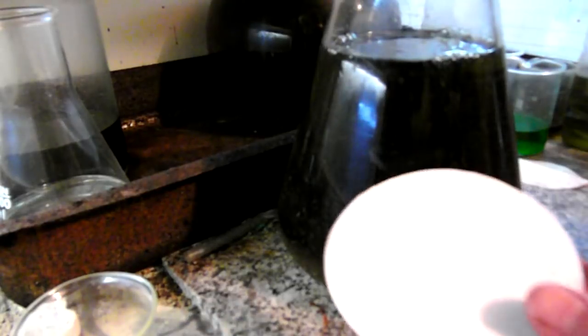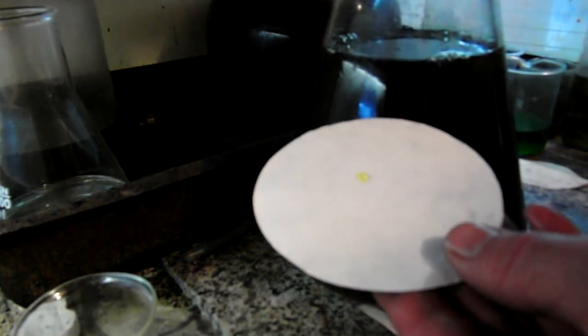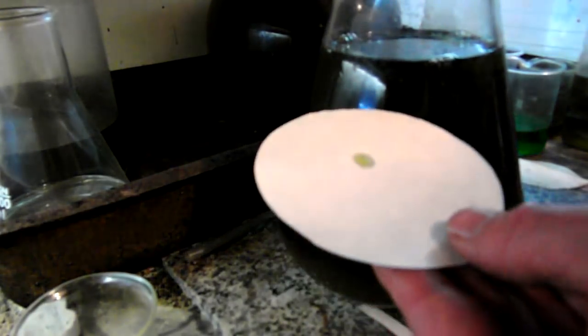I'll be washing and melting the gold powder which was left to settle in the previous video. First, I had to check with stannous chloride if there is still gold in solution.